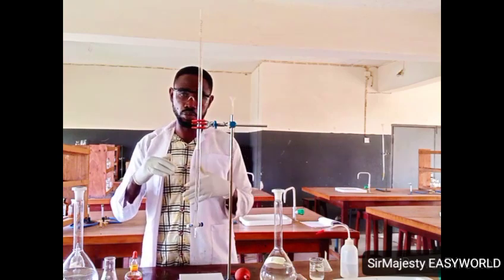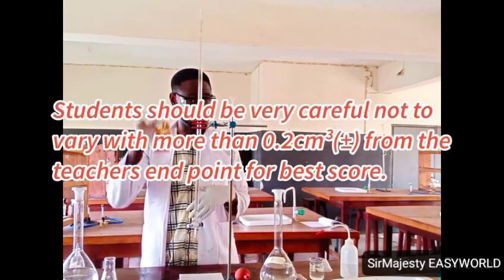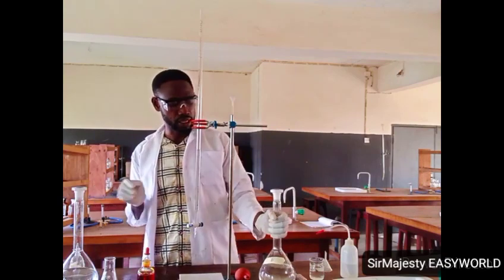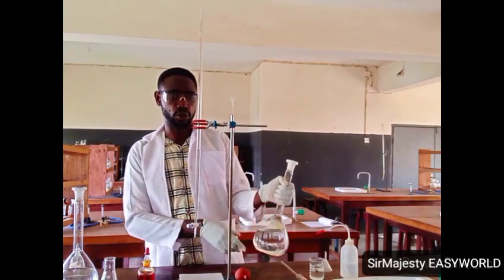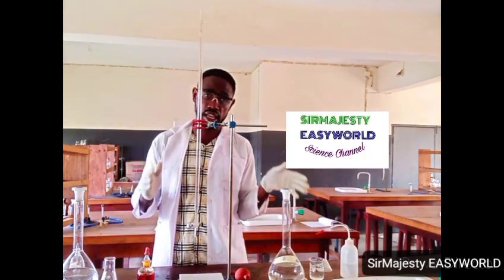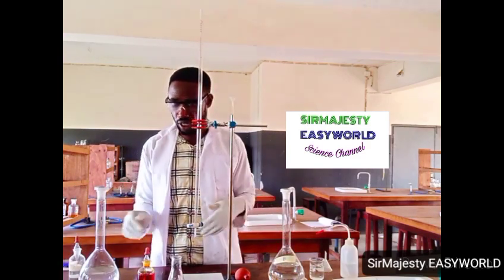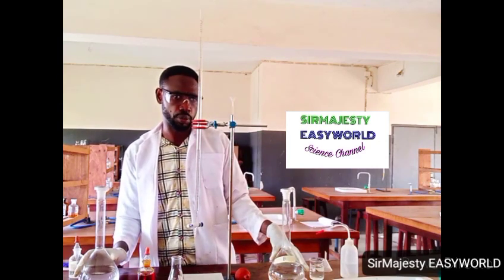So you see, it takes more acid, which shows that the most reliable indicator to be used should actually be methyl orange and not phenolphthalein indicator. Not just because this is a mixture of sodium carbonate and sodium hydrogen carbonate. Like I told you in a separate video, you will see my argument and my research, what my findings prove. It's somehow based on what the majority know in this double titration, especially the one involving HCl and sodium hydrogen carbonate mixed with sodium carbonate.